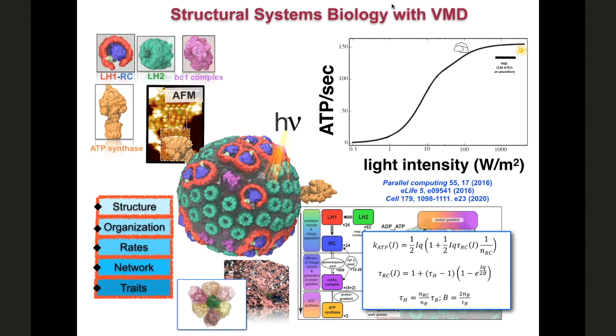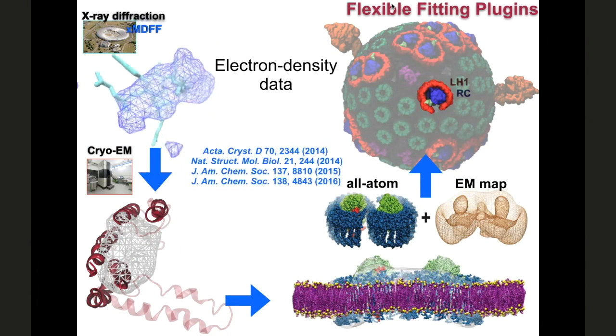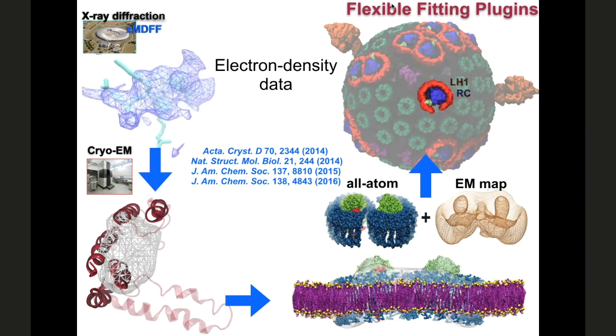Now let's dive in. How is VMD helpful? So the first thing, as John mentioned, is we can tie in experimental data. We can, of course, tie in X-ray crystallographic data. We have a tool called MDFF, which is not a phasing tool, but a real space refinement tool. The electron density gets morphed during the simulations, and towards this morphed electron density, the side chains of a protein get fit. So it's a side chain refinement tool, if I may.